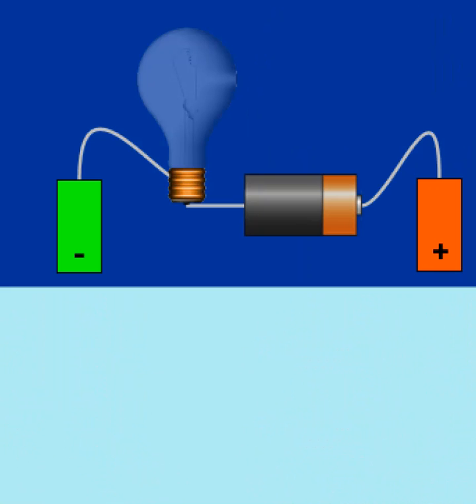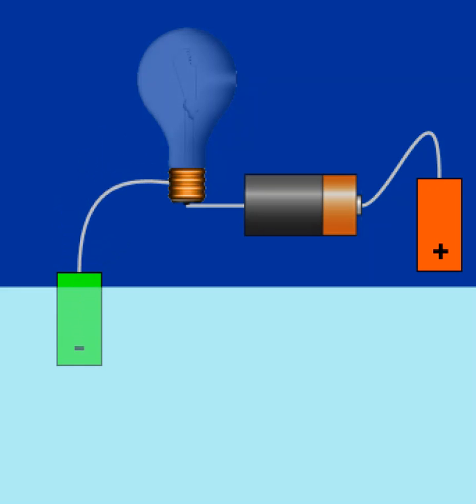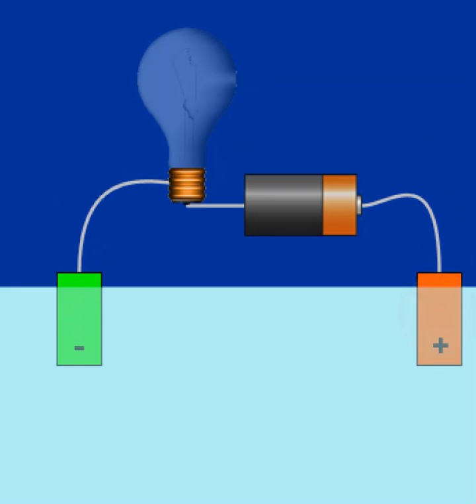Okay, now we're ready to start collecting data. So I'm going to start with distilled water and show you what happens. Now this apparatus, the way it's set up is that the battery has electricity running through there, but it's not a complete current, so no electricity will run through the light bulb unless electricity can flow between the green and red electrodes. So I'm going to put these down into our distilled water. And because no electrical current can travel between those electrodes, the light bulb does not come on. So I don't see any little rays of light coming on.